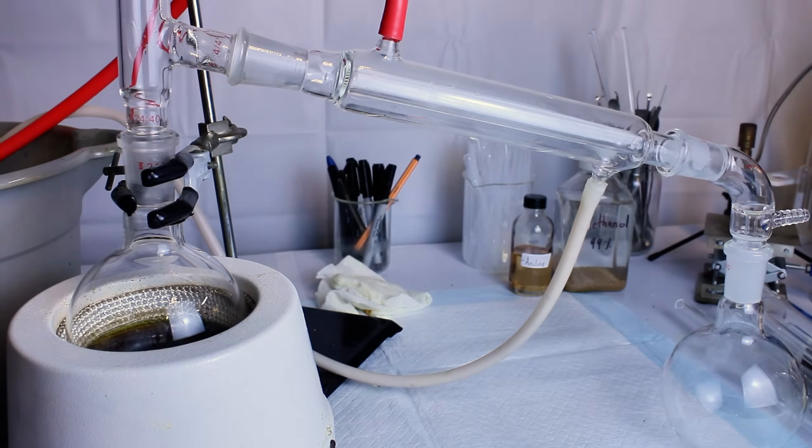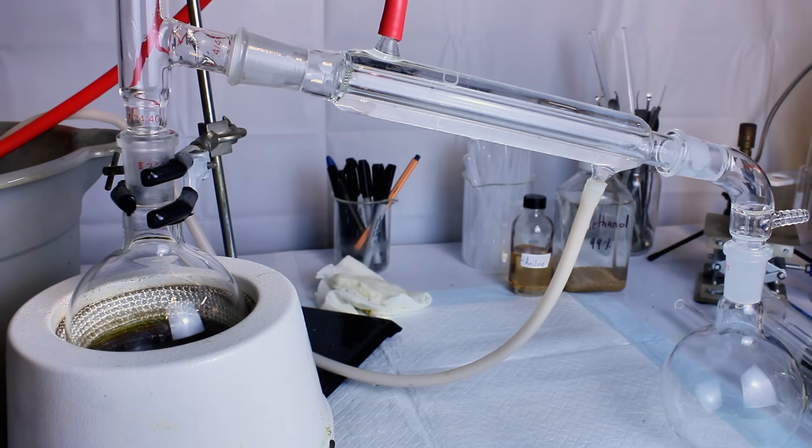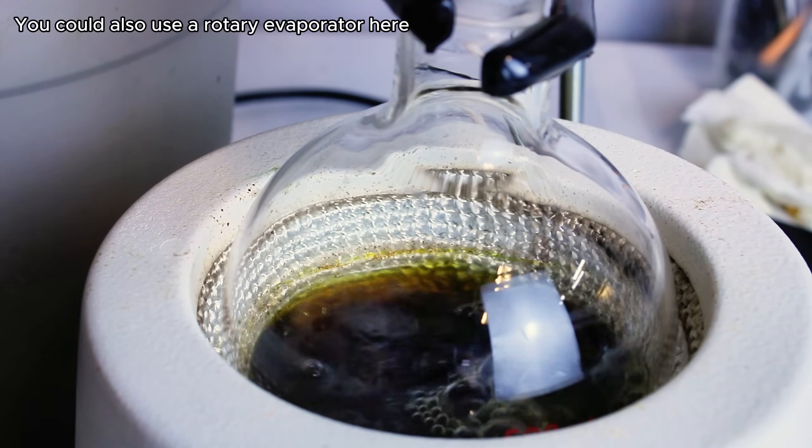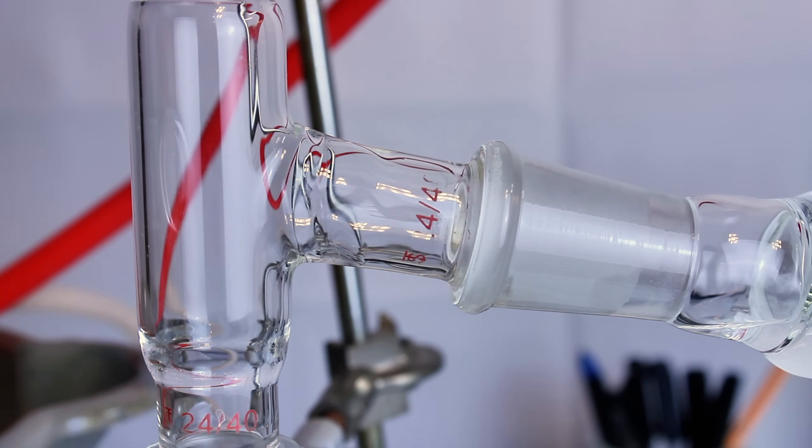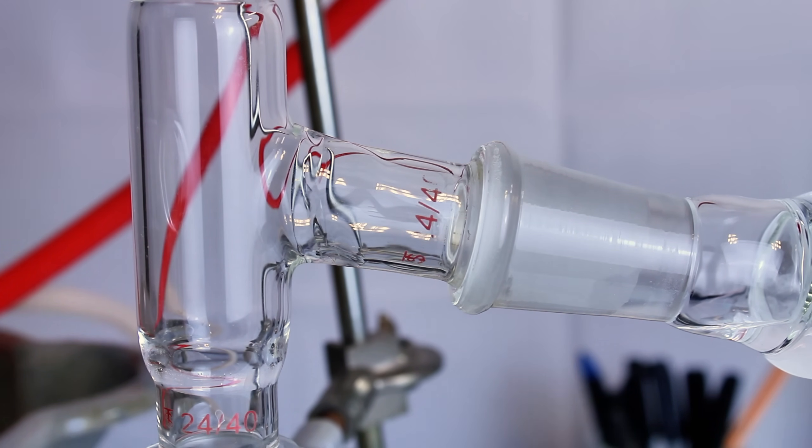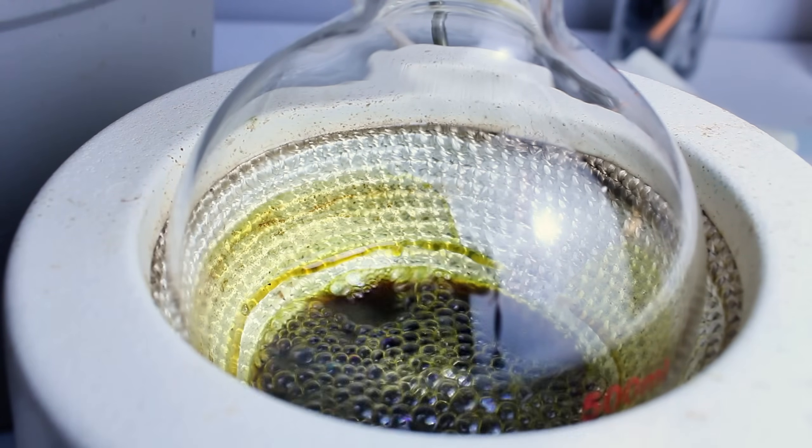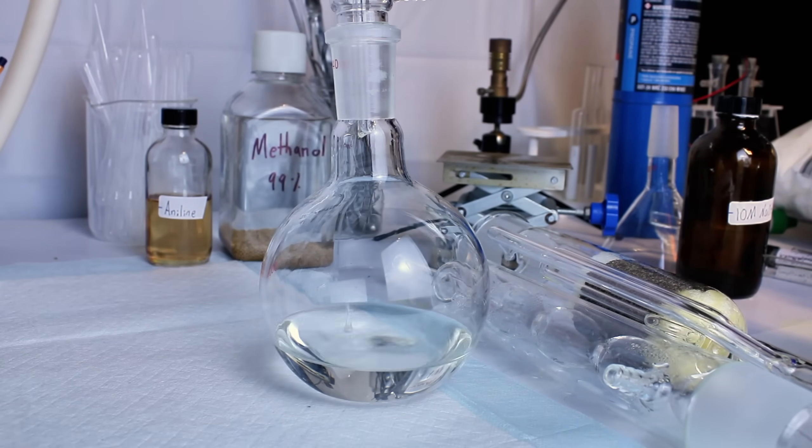I then set this up for a standard distillation to boil away as much of the excess isopropyl from my extract as possible. This is something you might typically do with a rotary evaporator if you are extremely wealthy and happen to have one, and it's also typically something you'd only do with an expensive solvent, not typically isopropyl. Once I collected about 100 milliliters of isopropyl, I cut the heating and set my flask aside to cool.